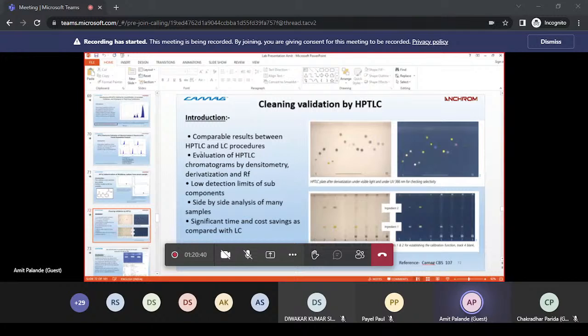Adulteration of the toxic argemone oil in mustard oil by HPTLC. We know sanguinarine is a very toxic polycyclic ammonium ion present in argemone oil, and if any adulteration of argemone oil in mustard oil was done, we have detected that by using the HPTLC.